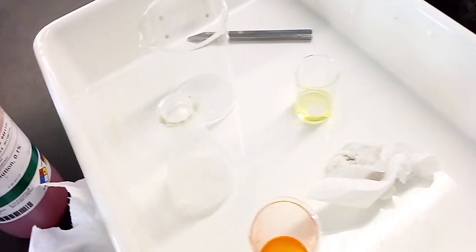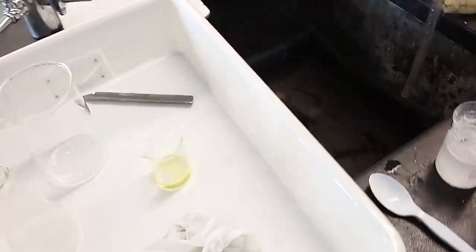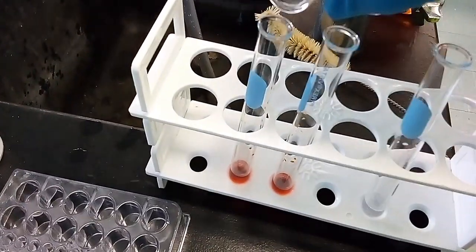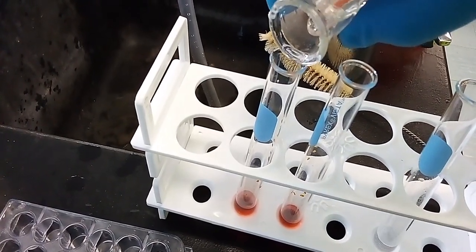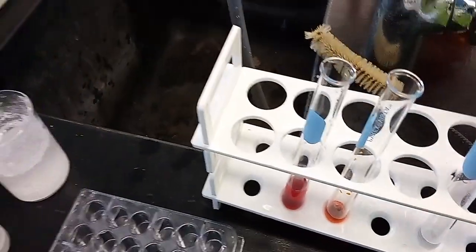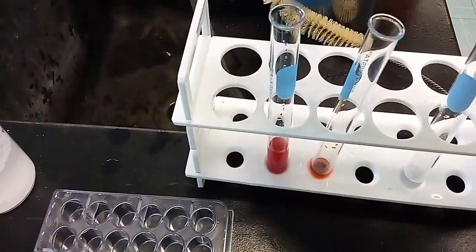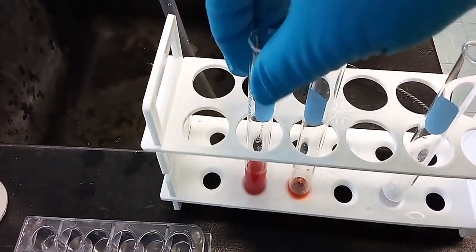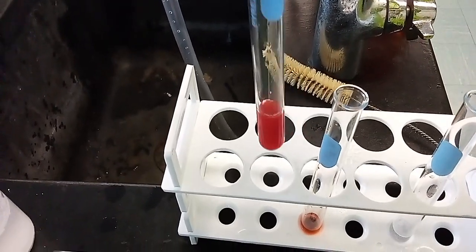If you add a base, it will change color. We're going to see that. I have some over there, and I'm going to show you the methyl orange first. I'm going to add a little bit of acid, which is vinegar, in here, and you're going to see how that turned red relatively quickly. This is the indicator. It was orange. This one here is how it looks before, so you can see that it's orange, and you add the acid and it turns completely red. So I know that I have an acid in here.